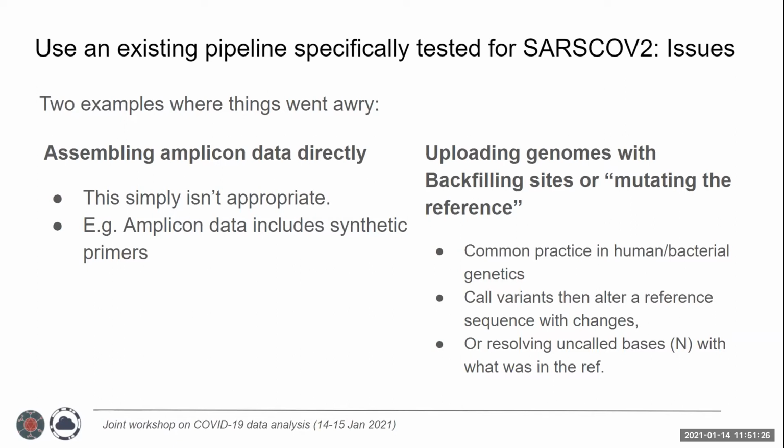So in this case, we've heard it from the other speakers, but it's important to remember that you need that extra step of filtering and masking those primer sequences before you really start to use it in your variant calling. But again, this is handled by the SARS-CoV-2 specific pipeline. So it's more a question of understanding what these tools are doing and then just sort of leaving it at that.